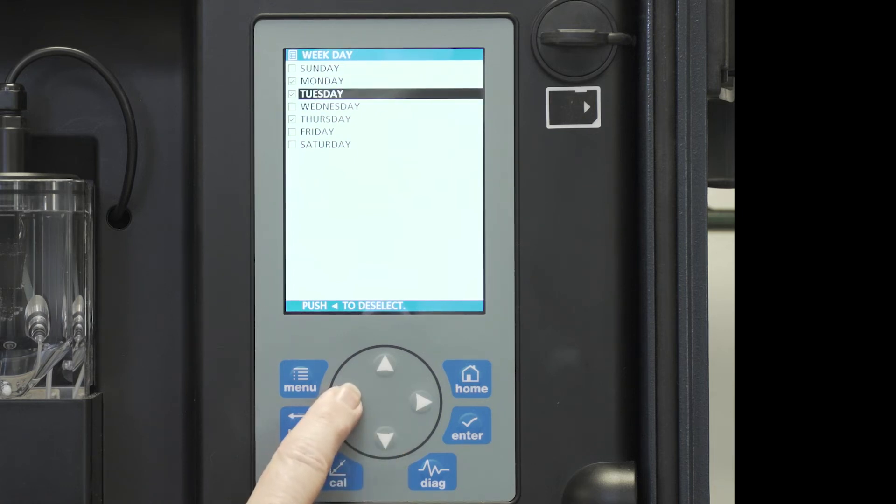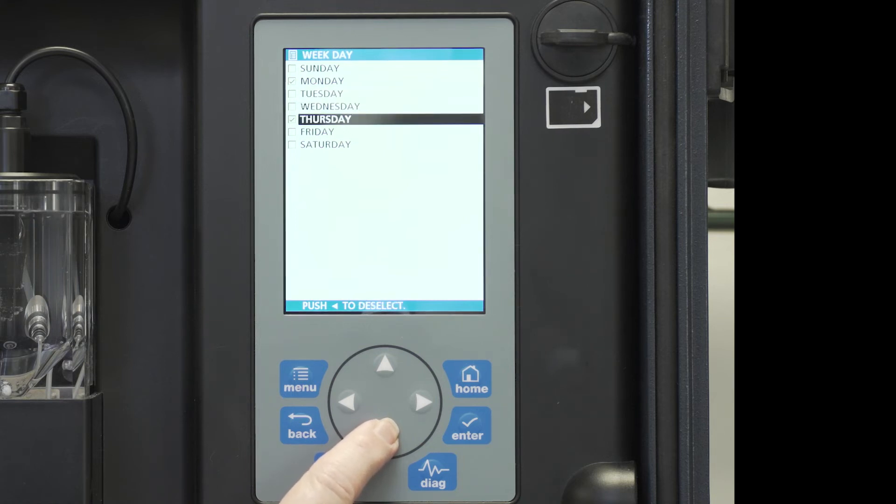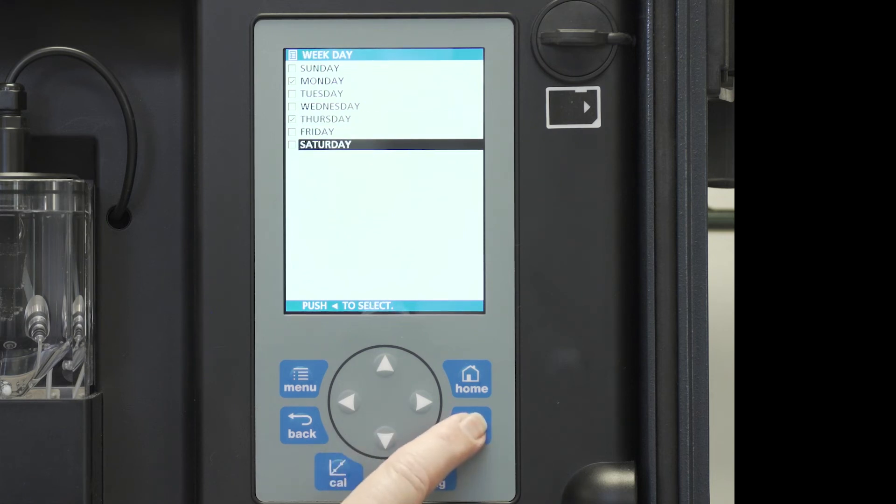I want to deselect Tuesday. Wednesday has already been deselected. Thursday is what we select. And we press enter.